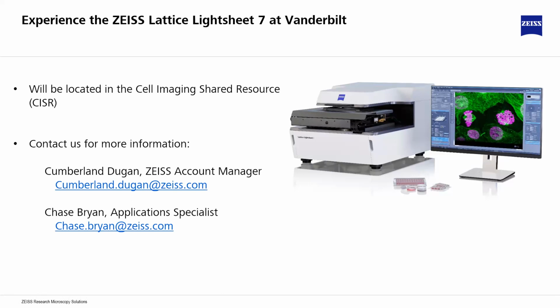Let's say we want to do some kind of a treatment experiment. How accessible is the sample as we go? That's a great question. So the sample chamber is enclosed during the acquisition, but there are injection ports, so we can route tubing into the sample chamber. You can do an infusion on the fly during the experiment, and long term, I believe that there is triggering capability on the system. So if you wanted to run something like an infusion pump coupled with the triggering in the software, I believe that would be a possibility as well.